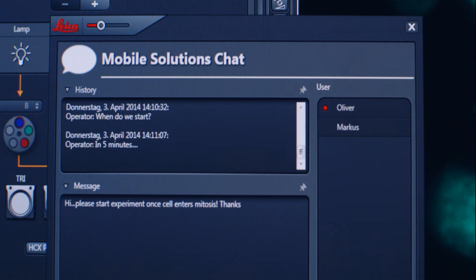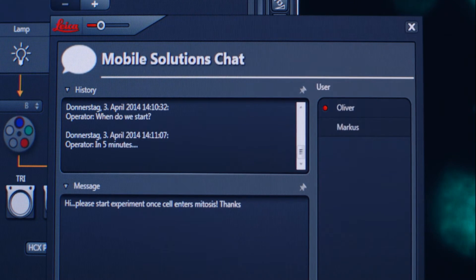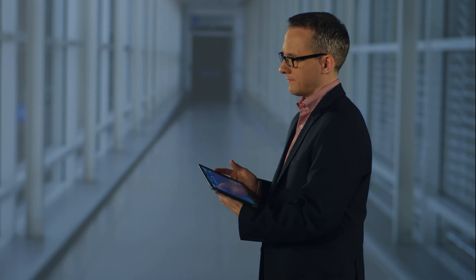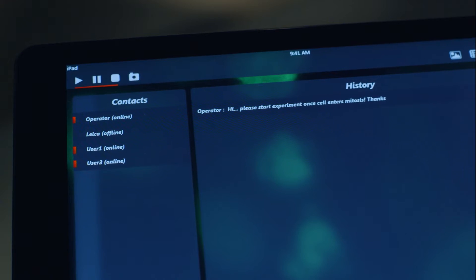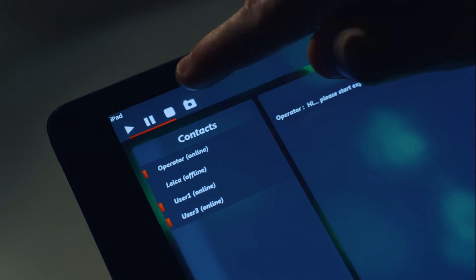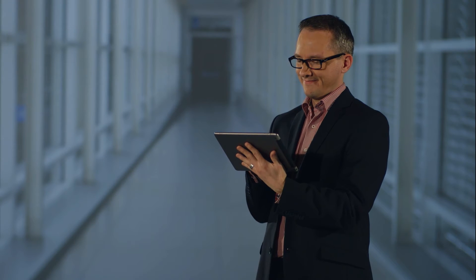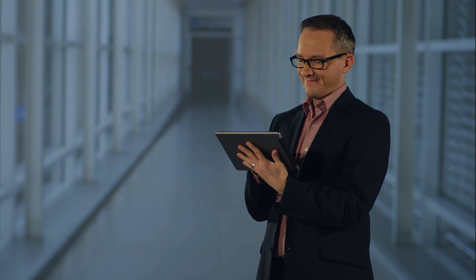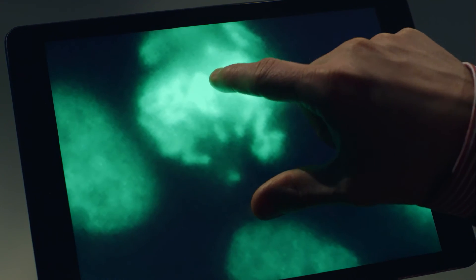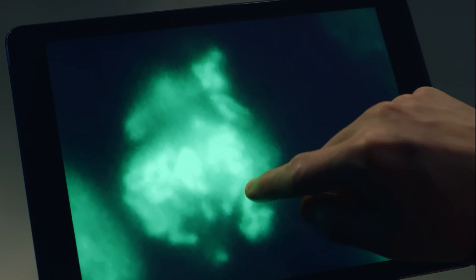Be in control of your experiment. Check the status of your experiment whenever you want, wherever you want. Mobile Connection gives you an overview of all parameters so that you can start your experiment remotely when the conditions are right with a simple click.